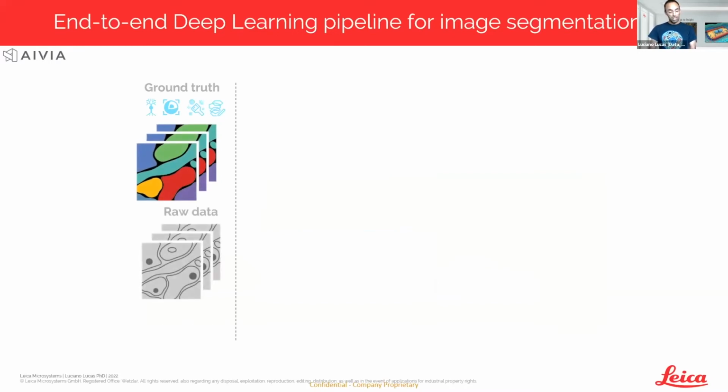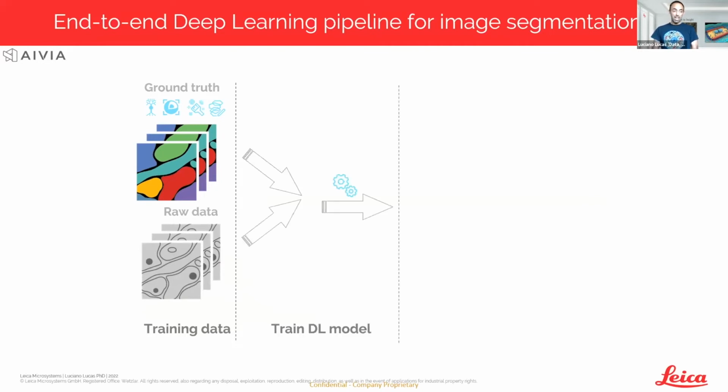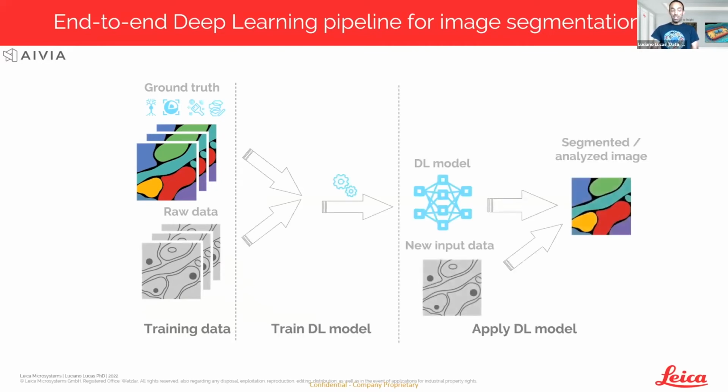We did a lot of work starting from 2016, trying to test models that are good for segmentation, but it's very hard to get generic models, to get to a point where you can really apply a model to many different data sets. And generically, that's what it looks like.